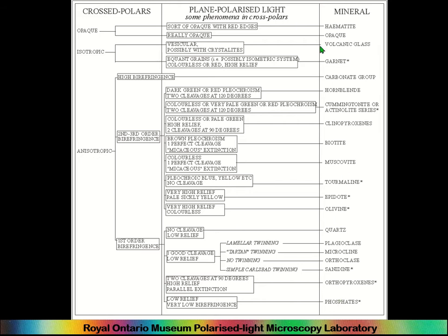And these enable you to identify minerals, but there are far more minerals in the world than in this list. In fact, when I originally studied geology, our list of rock-forming minerals we had to study was a lot longer than this. And there are actually more than that on top of that. So it may be that the mineral you have found is not on this list. It may be on this list, but it's not identifying for all sorts of reasons to do with the firing of the pottery and it being very rare in the pottery entirely. So that's why the properties, your ability to describe it, is more important than identifying it.